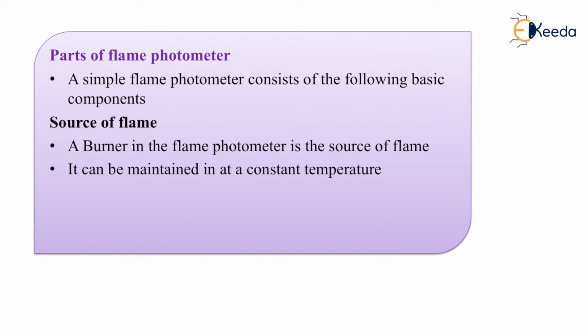Now we cannot have a flame with a very high temperature or a very low temperature, or the temperature being variable and keeping on shifting. We have to make sure that the flame is set up at a particular point and it remains at that point even after a long time.